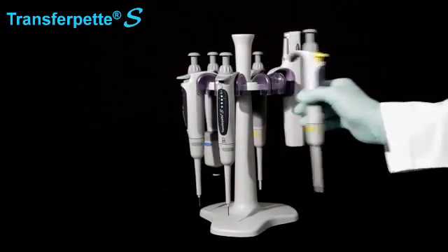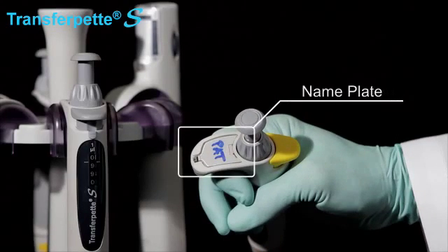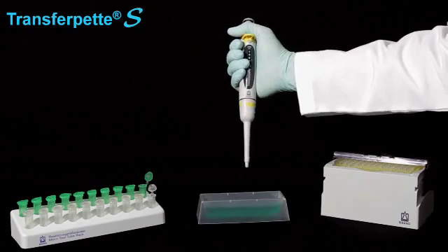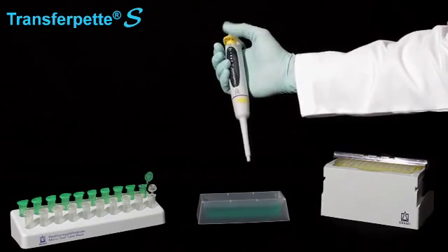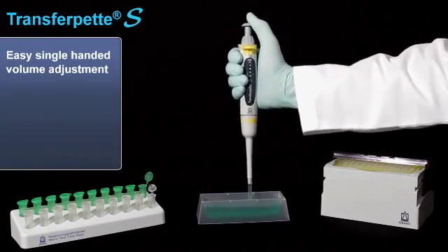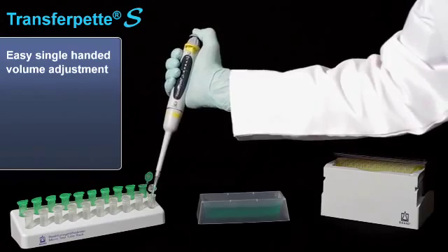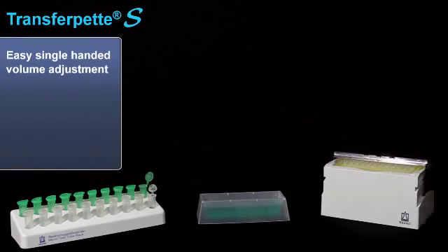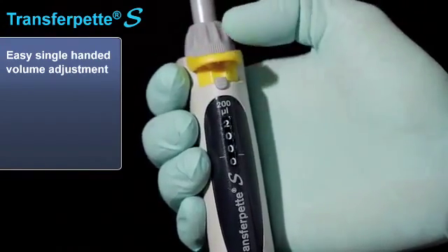The Transferpette S truly shines when in operation. Single-handed volume adjustments while wearing gloves makes all of your pipetting operations easier and faster. Simply raise the brake and adjust the display to your desired volume.